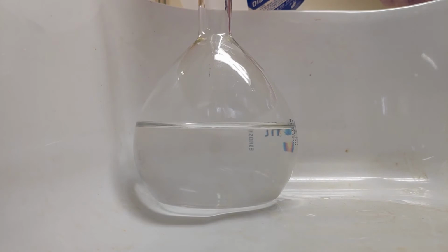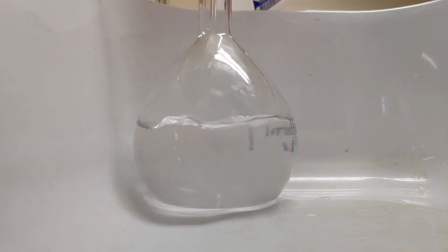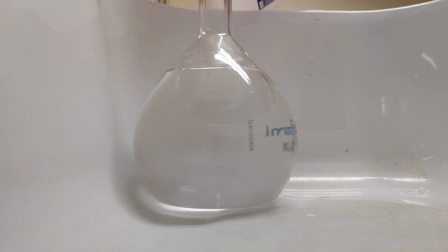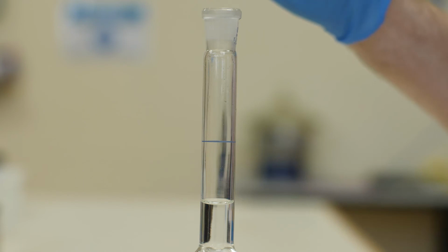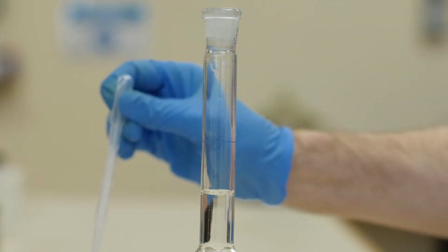Then, more water is added until the water level reaches the neck of the flask. To bring the water level up to precisely 500 milliliters, more water is added slowly by pipette until the bottom of the meniscus reaches the fill line.